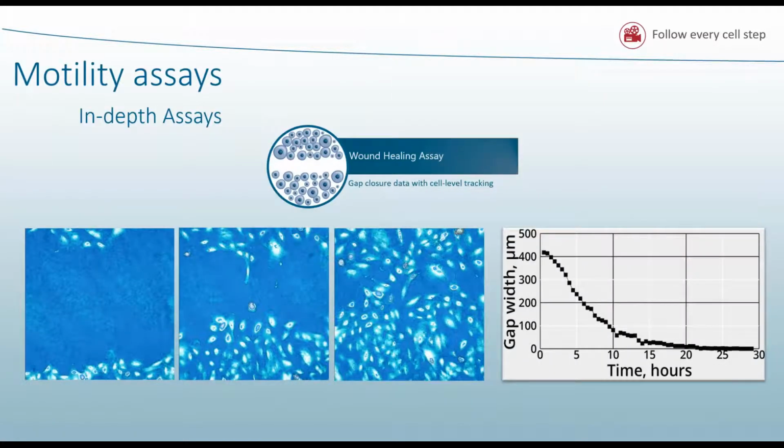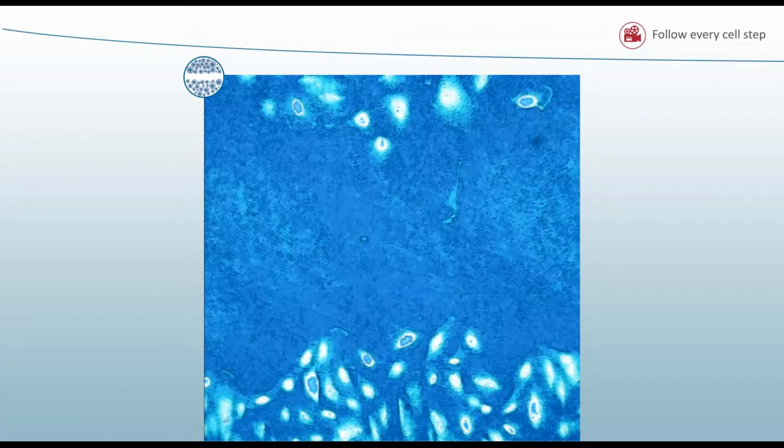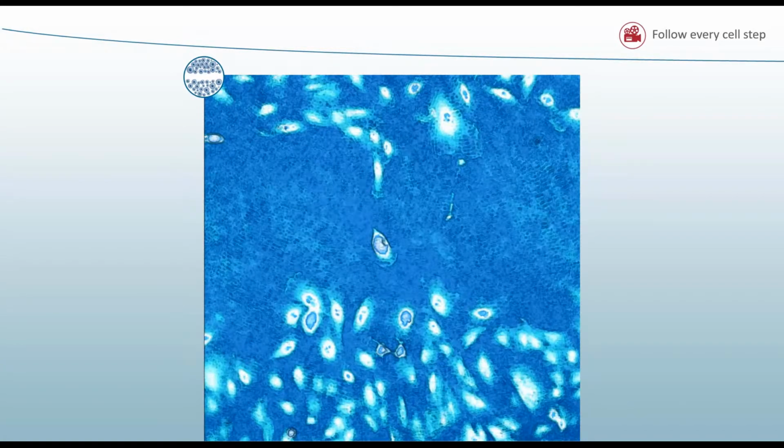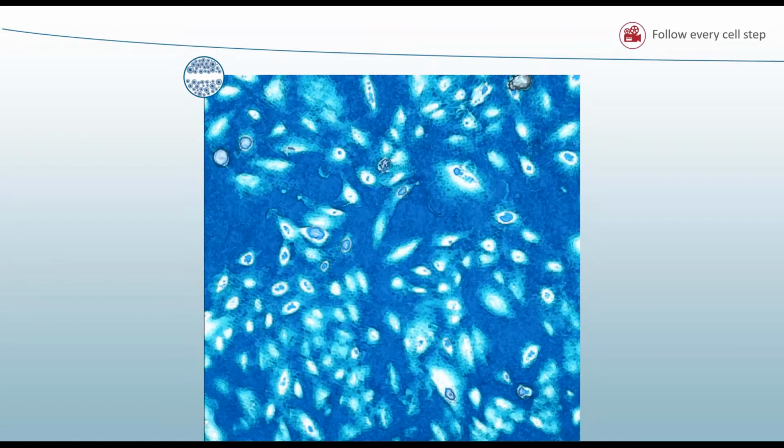Another way to study motility is looking at motility assays. Wound healing assays, where you can study gap closure and where you can track cells at the same time. So here I picked out 3 pictures, the beginning, the middle, and the end of a time-lapse movie, showing how the gap is closed. And to the right is the corresponding diagram showing the gap closure. But because it's so pretty to look at, I just have to show you this movie. This is how the gap is actually closing. And you can see that the cells are moving very differently. Some move almost like a cell front, while others moved more like individuals and just got ahead of all the others.